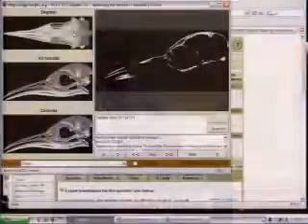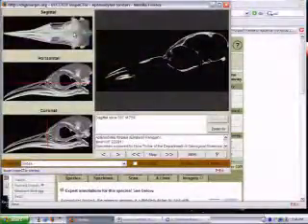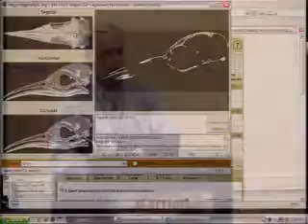So we have this skull rendered as a movie, but we also have those data correctly proportioned in 3D space. This slice viewer that you see here, which is a fairly low technology Java applet, does in fact retain at all times the correct geometry of the specimen. So I can ask a simple question like, how long is this skull? And see that it's 187.22 millimeters, and that's a correct number.